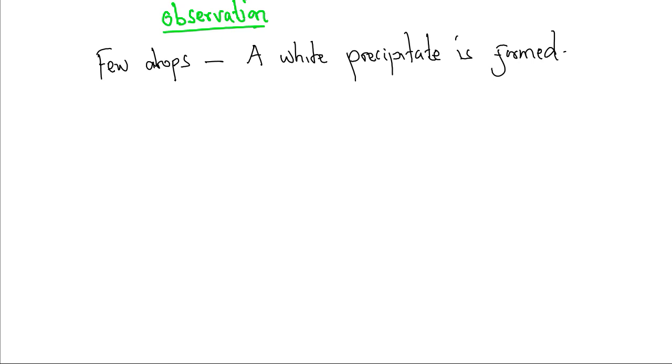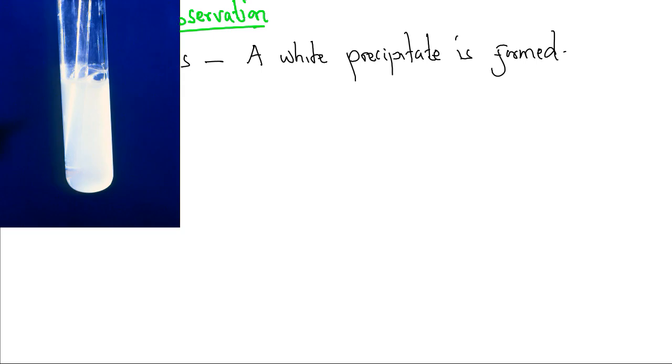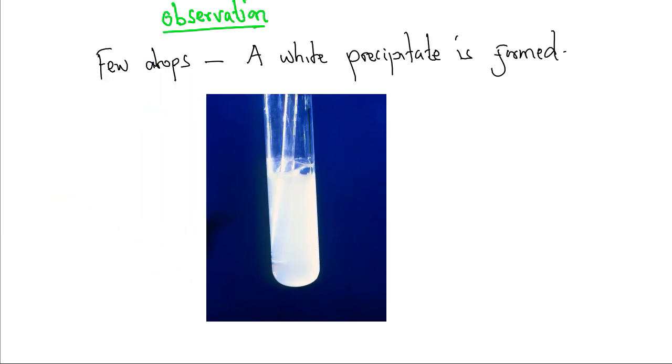The observation is simply white precipitate. And this white precipitate is due to formation of magnesium hydroxide.